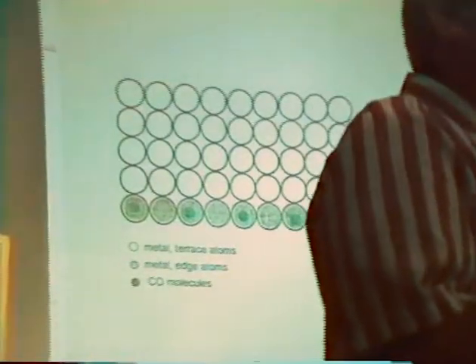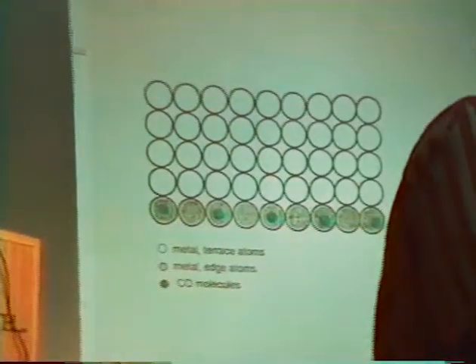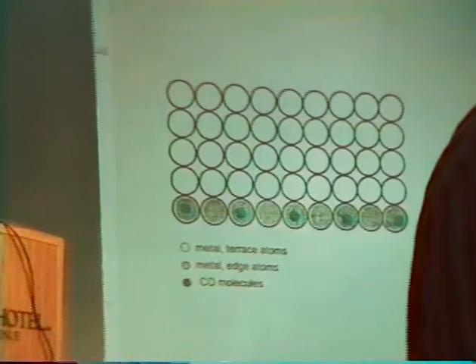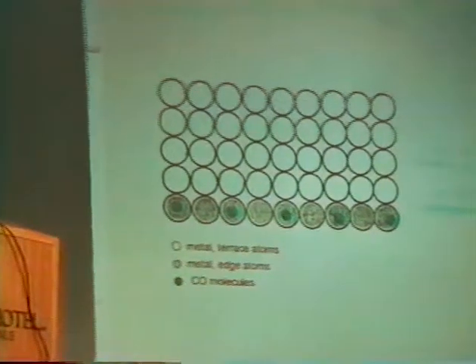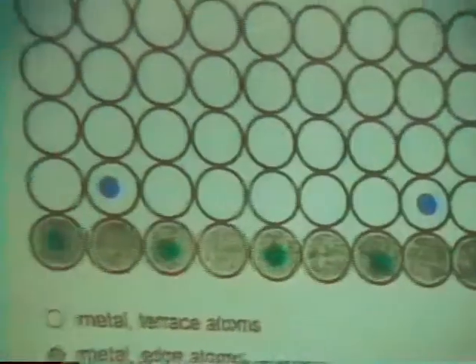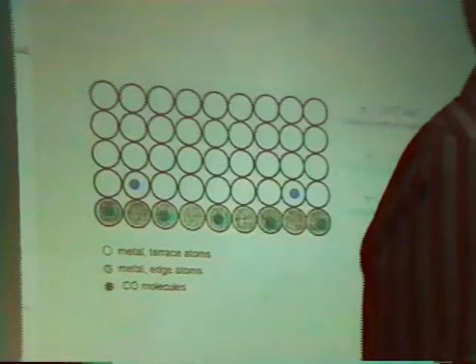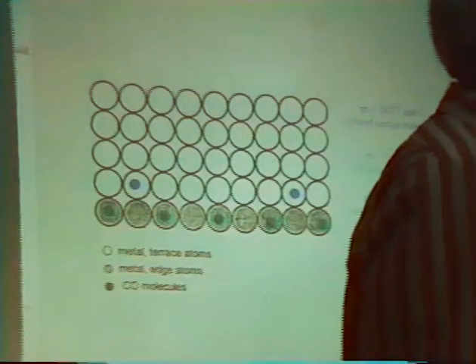If I populate that whole step edge with a linear array, the interaction will raise that in-phase mode, which I showed you, up to about 2077. So now with that coupling, this system has the same frequency as these isolated terrace atoms, and so they will strongly couple together. And there'll be a strong interaction.